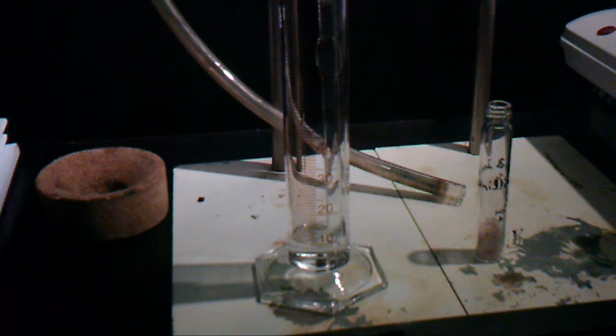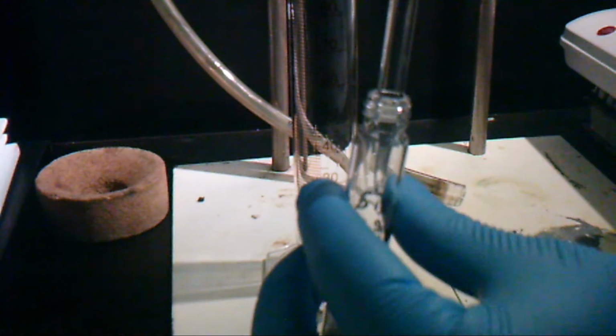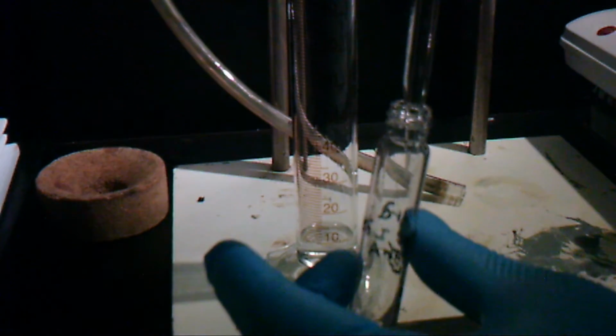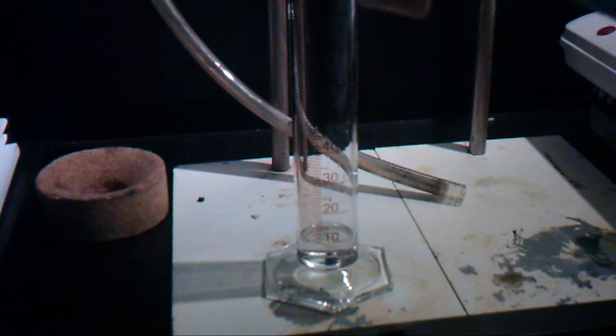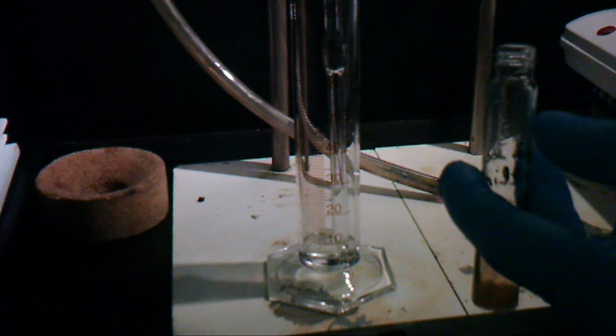So to start with, we take with a pipette some isopropanol and we put it in the vial we have the tetraIodoaniline. As you can see, it dissolves in the isopropanol, but not very fast, so we will need to shake it after we add all the isopropanol. So, tetraIodoaniline is our ligand in this reaction.